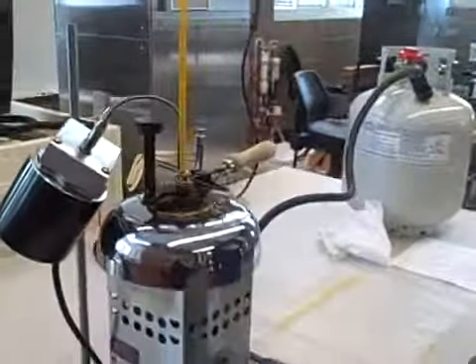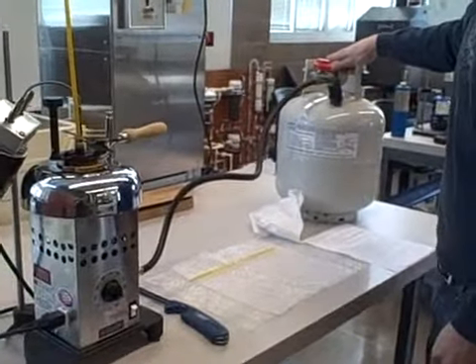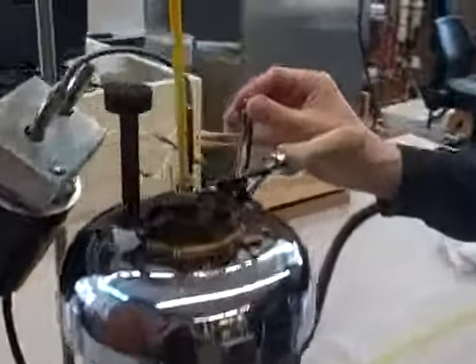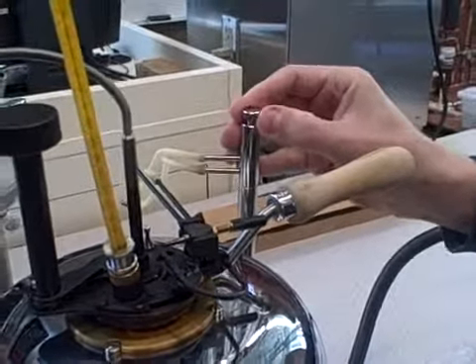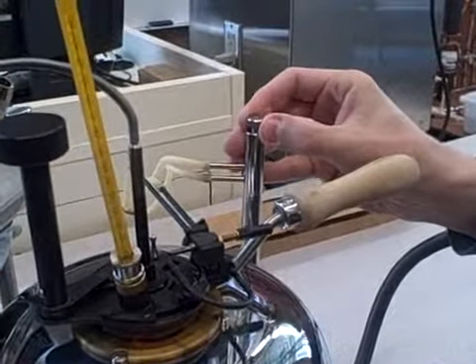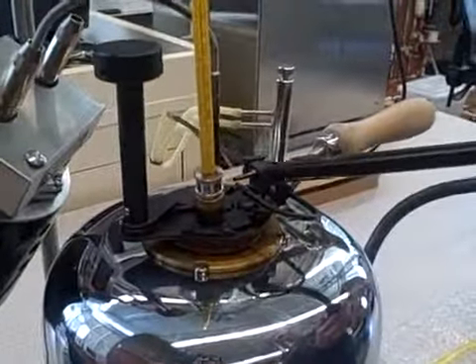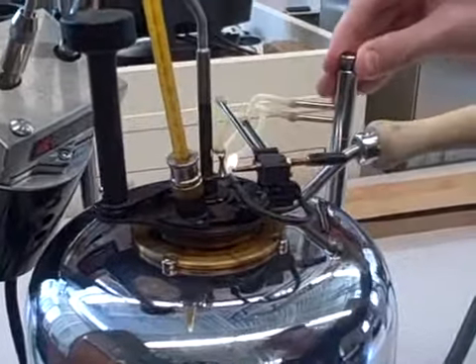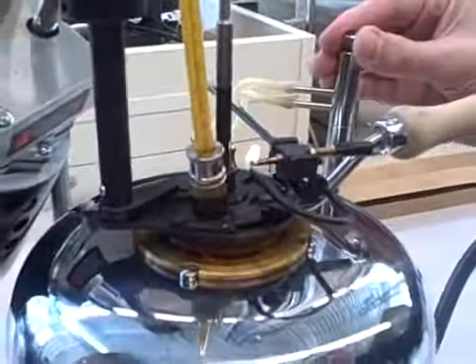Now we're going to light the test flame. Just barely crack the propane tank, and then if you barely crack the flame adjuster — just turn it the tiniest bit and almost re-close it, because you just need the tiniest little turn. Then you light the test flame and close it even more until you have the adjusted length of flame, which is 5/32nds of an inch.